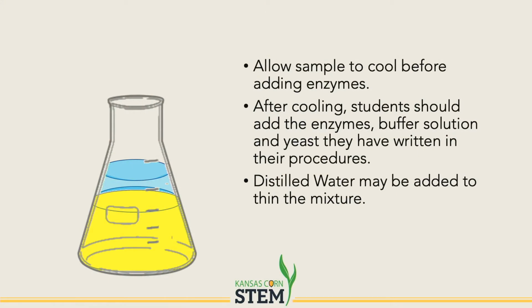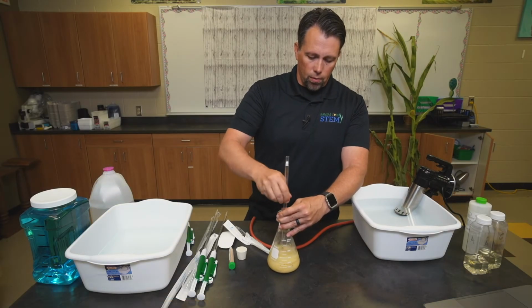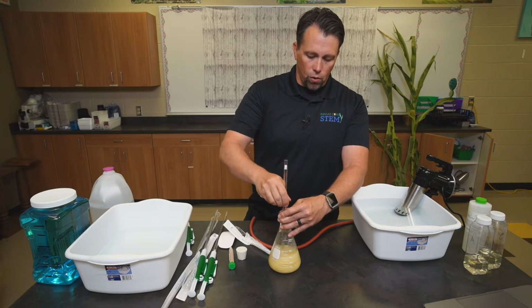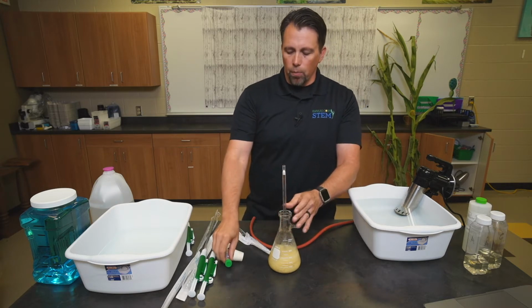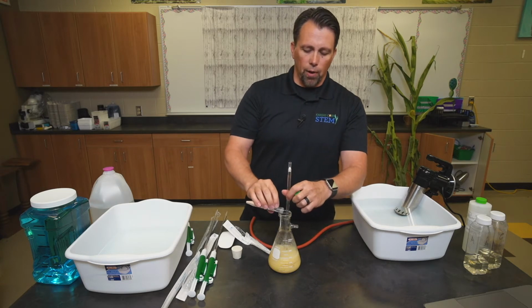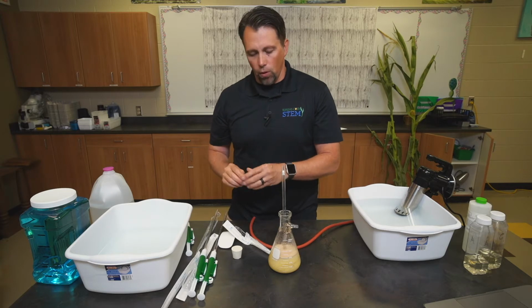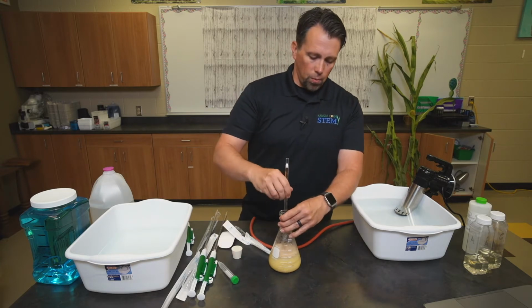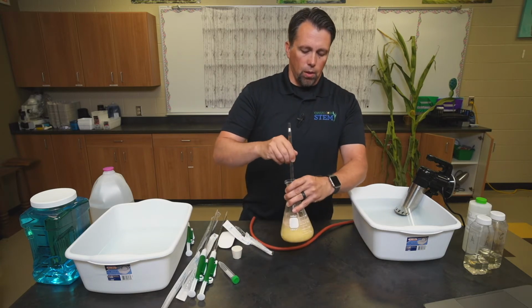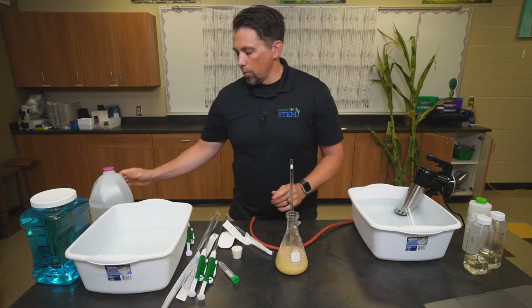And use this as a stirring rod here. Stir up our corn mash. Go ahead and add the yeast. And I limit them to 5 grams of yeast. You wouldn't necessarily have to, but just to keep them all in the same parameters. Then you can add some water.